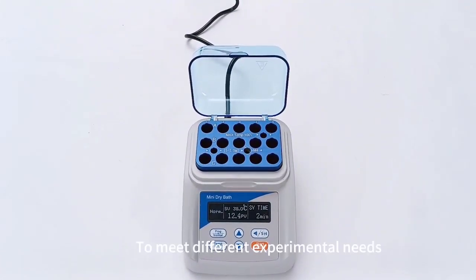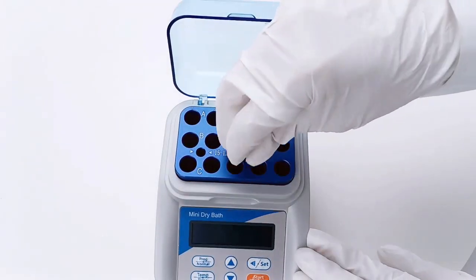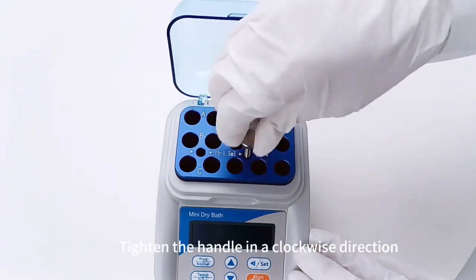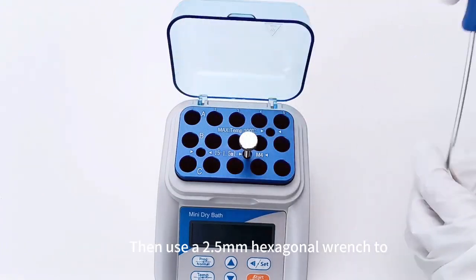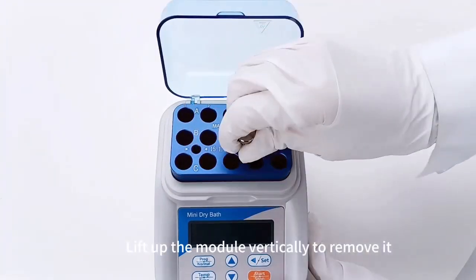To meet different experimental needs, put the module handle vertically into the corresponding hole of the module. Tighten the handle in a clockwise direction. Then use a 2.5mm hexagonal wrench to loosen the fixing screw. Lift up the module vertically to remove it.